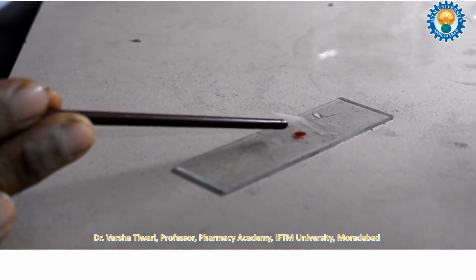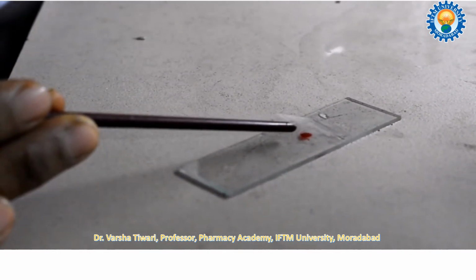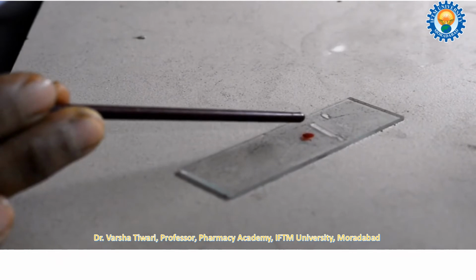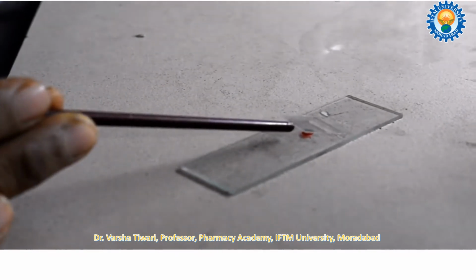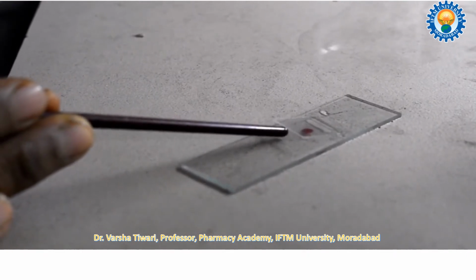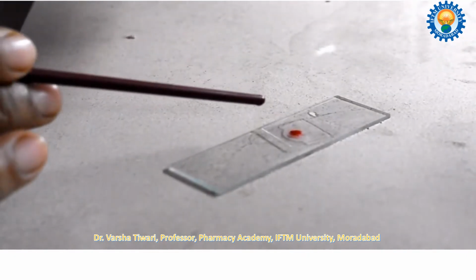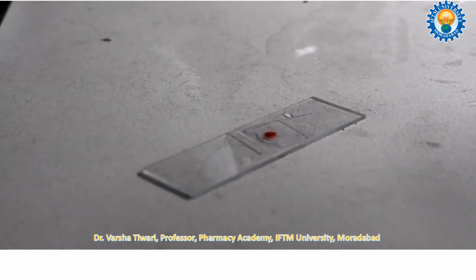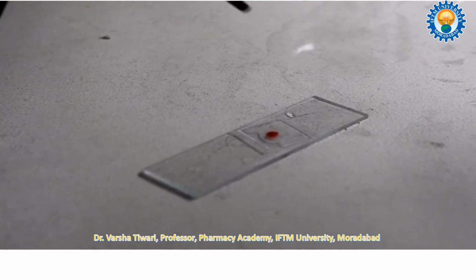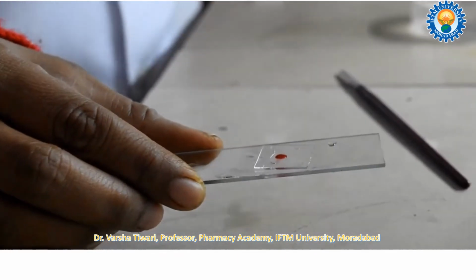Slowly we have to keep it. See, first you are going to do like this. Now slowly you are going to keep the cover slip. Why are you doing it like this? Because if you keep the cover slip directly, air will be trapped and air bubbles will come. Now we are going to observe in the microscope.